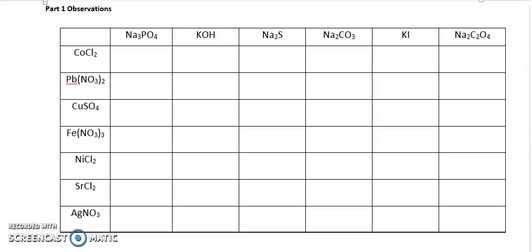So in the back of the room where you found the page protectors and the grids, you're going to see a red bin of bottles which are marked unknown number. All of the unknowns are one of the chemicals that you had tested today already. Your challenge is to try and figure out which one of the chemicals you actually have been assigned. You can react it however you want. You're going to need to make that decision.